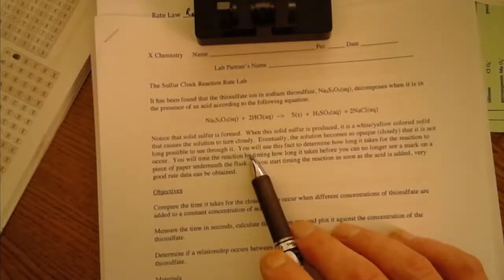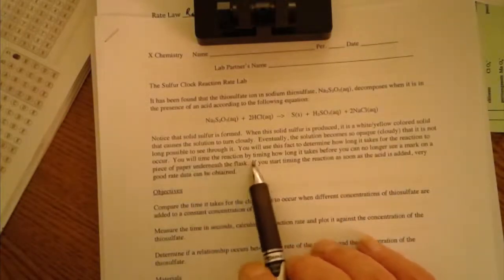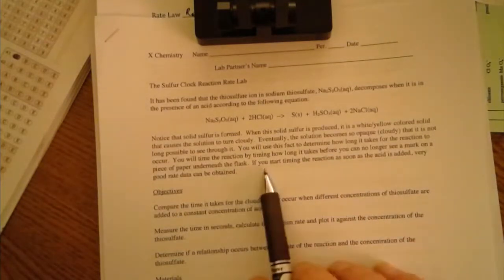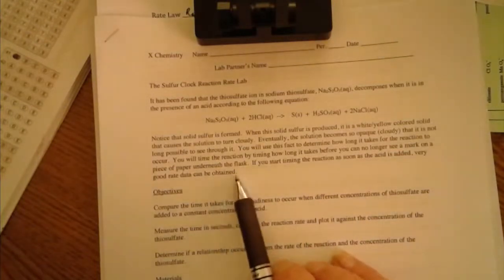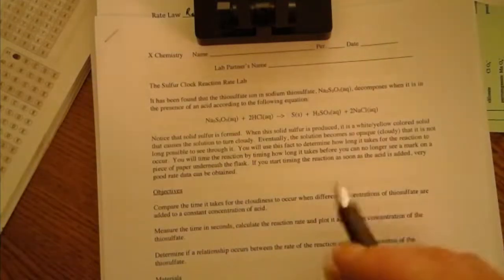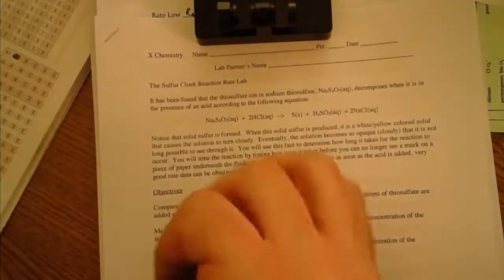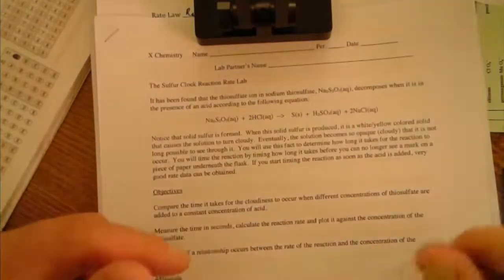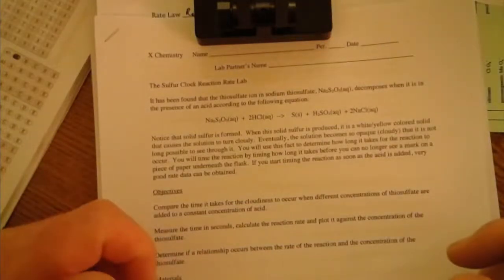Okay. Perfect. You will use this fact to determine how long it takes for the reaction to occur. You will time the reaction by timing how long it takes before you can no longer see a mark on a piece of paper underneath the flask. If you start timing the reaction as soon as the acid is added, very good data can be obtained. So basically you're going to make a bunch of concentrations, 4 to be exact, and then you're going to pour the acid in, and then you're going to click a timer. Or probably on your phone, right? What do we expect? The lower concentration should take the most time, right?